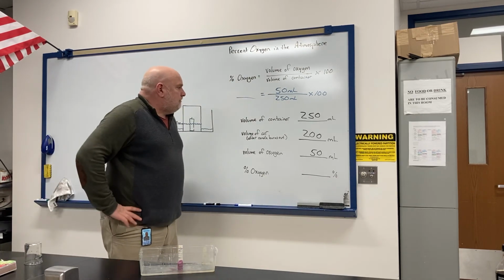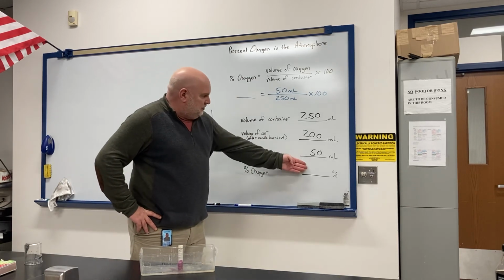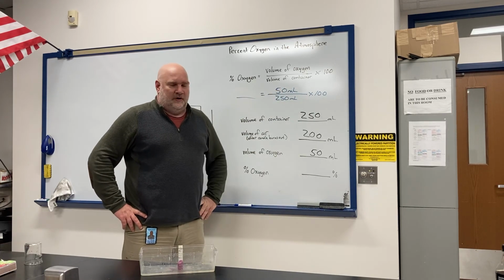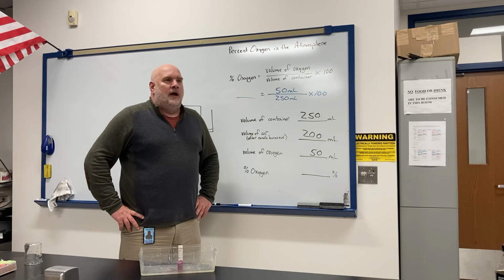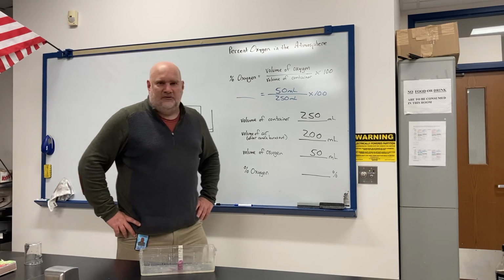That's the lab, because your objective in the lab is to figure out the percent oxygen. Once you solve that out and get your answer, that is what we're trying to accomplish. Once you have your percent oxygen done, there's a few questions on the back of the lab, and then that's it. So that is the percent oxygen lab.